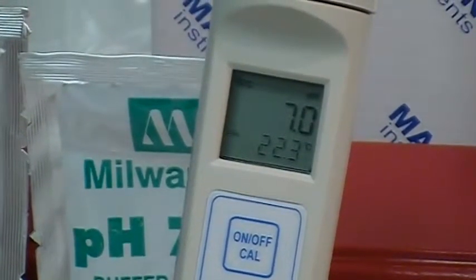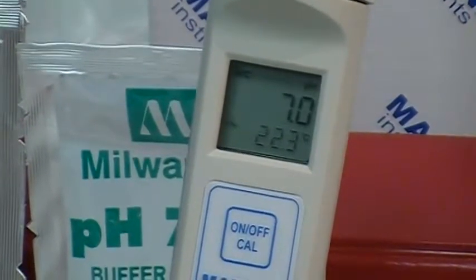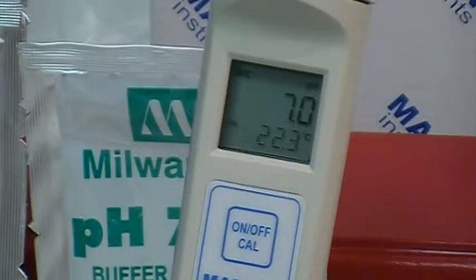You'll also see that the display is reflecting a Celsius display on the temperature. We'll get into how to change that from Celsius over to Fahrenheit in just a moment.